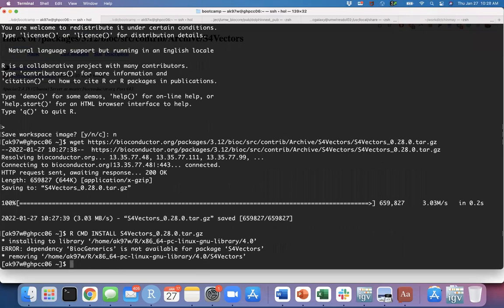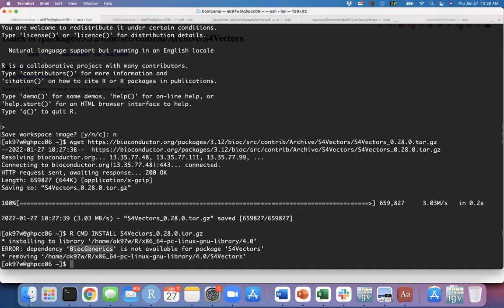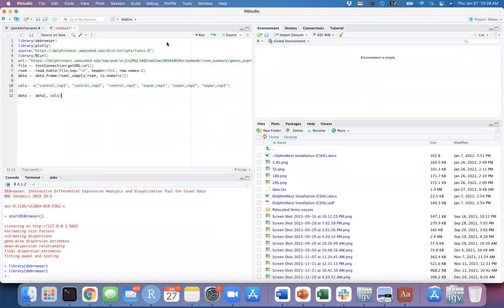Yeah, this is going to be more complicated, I think, here. I don't know, maybe you don't have this problem because I have been using many different versions. But if you have this problem, I have another image to fix this, so I can send you that. I've already installed a version that you can start the DSig to install. Just let me know, but I'm going to continue here not to spend your time for now, okay? Because I need to install the earlier version and then install this to be able to test. But okay, I'll continue now.